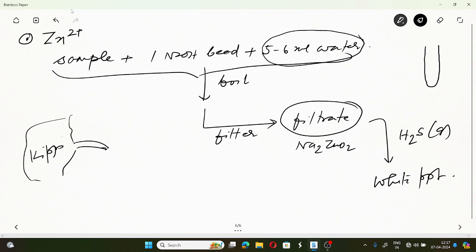এবং এখানে দেখবে একটা রাবার টিউব লাগানো আছে. So what should be done? এখানে একটা তুমি গ্লাস পাইপ ভালো করে ধুয়ে এই গ্লাস পাইপটা লাগাবে কিপস অ্যাপারেটাসে. ঠিক আছে, and use the glass pipe, যে গ্লাস পাইপটা ক্লিন করে নেবে. পুরনো গ্লাস পাইপ লাগানো থাকলে সেটা ইউজ করবে না. ঠিক আছে, একটা ক্লিন গ্লাস পাইপ নিয়ে you pass H2S gas like this through your solution. এখান থেকে H2S gas pass যখন করছো, ঠিক আছে, white precipitate of zinc sulfide.